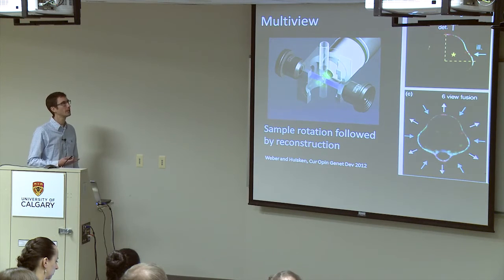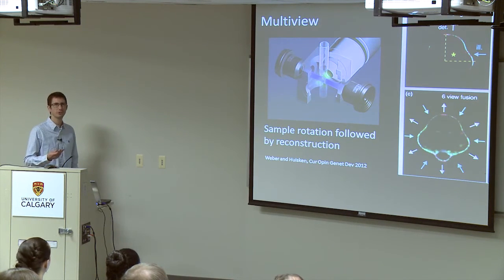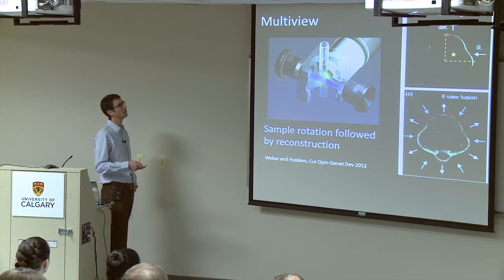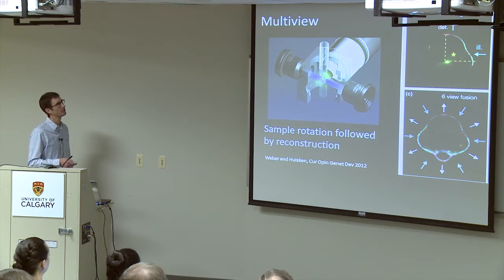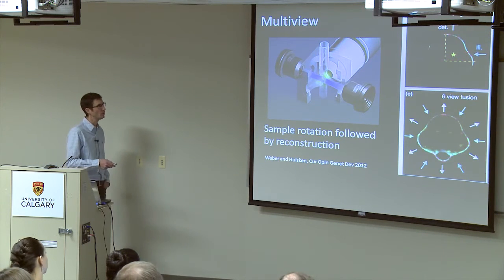So in general, you're getting maybe up to 200 micron penetration. Zebrafish are usually pretty clear, so you get a little deeper into them than you would into human tissue or mouse tissue. So this entire zebrafish is probably about 400 to 500 microns in size. You can see that the illumination light is only penetrating about halfway through our sample, so we're not getting excitation of this half of our sample over here.